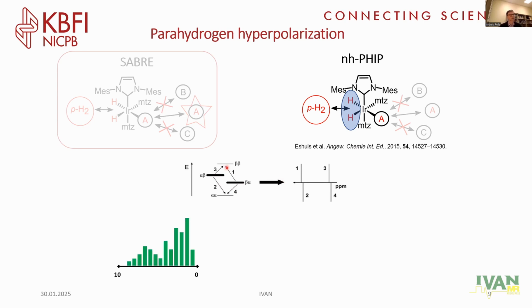So this is how we get more sensitivity out of this, but maybe more crucially, in a very complex biological mixture, we all know that our proton NMR spectrum is between 0 and 10 ppm chemical shift range. Turns out that these hydride signals that now report the presence of our metabolites resonate very, very far away at -20, -30 ppm proton, which is somewhere where you usually do not have anything biological background going on. So we are enhancing the signals that we detect and also placing them somewhere far away from those high concentration metabolites that we're not particularly interested in anyway.